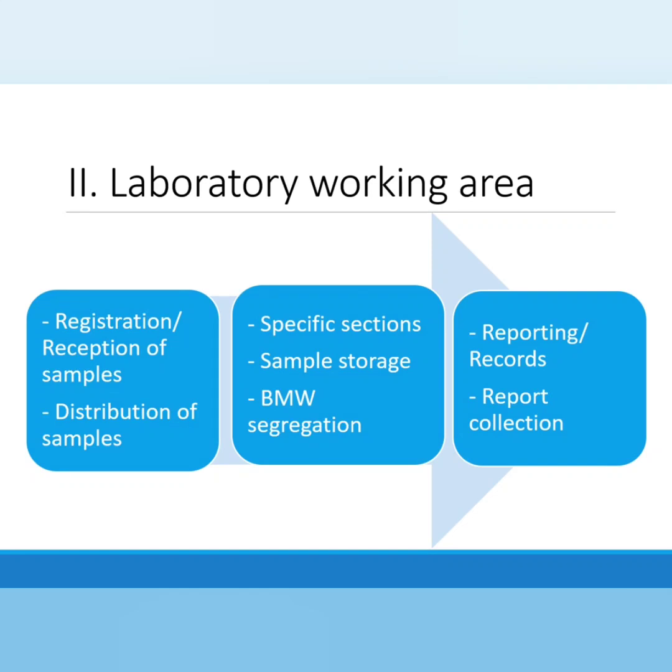The next areas are the specific sections where the different types of tests are performed. Then, a specimen storage area for the storage of specimens until they are discarded depending on the laboratory policy.